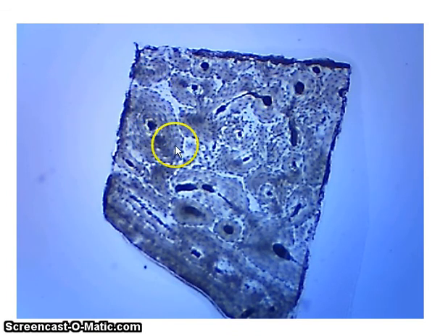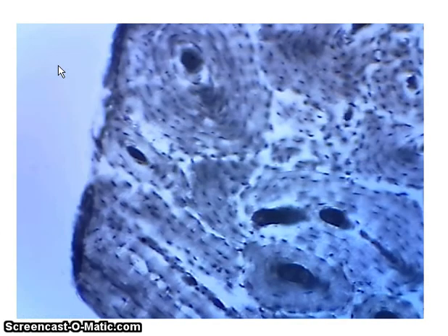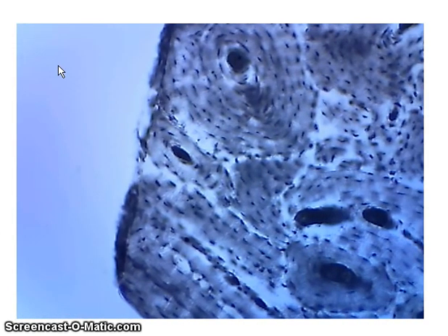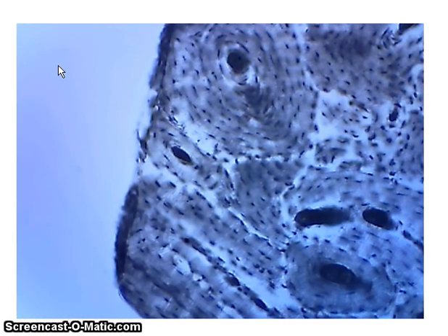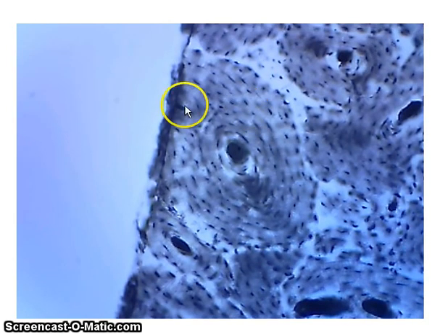Well, these are the osteons. The osteons are the functional units of bone. And the dark structure in the center, that is our central canal. So let me move up in power to 100x, and we can see this a little bit better. I'm also going to recenter on an individual osteon. So again, this is our osteon right here.